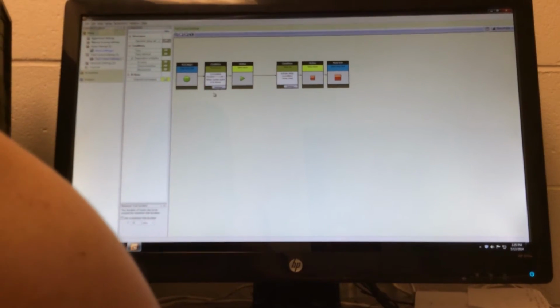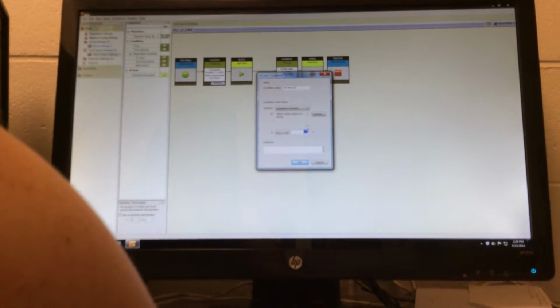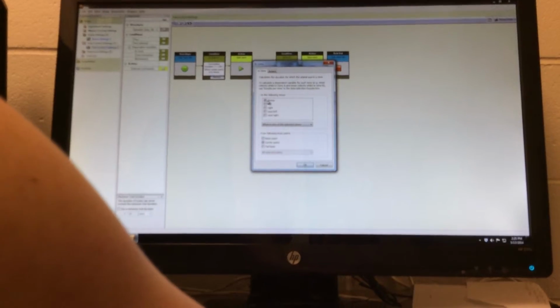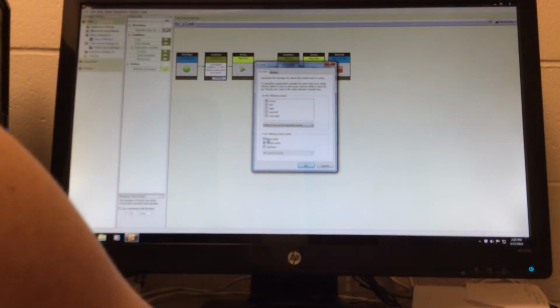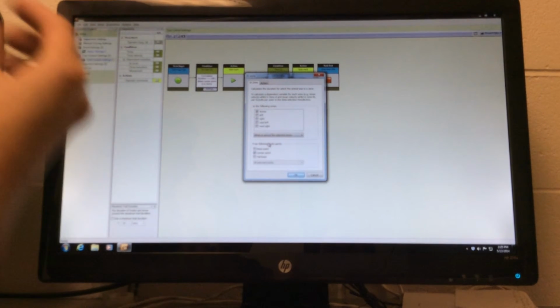You guys can change it if you go to settings, and then here you can change it to 2 seconds, 5 seconds, doesn't matter, whatever you want to do. You can also do it based on if you don't want them to start tracking until they go to the left side or the right side. So you can pick, do you want it to be when the nose point is detected? So you can choose your requirements for when you want it to start tracking.